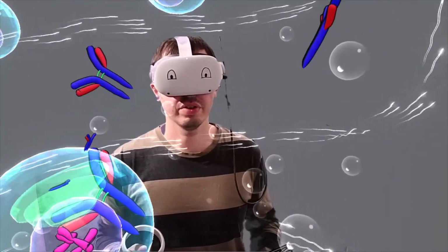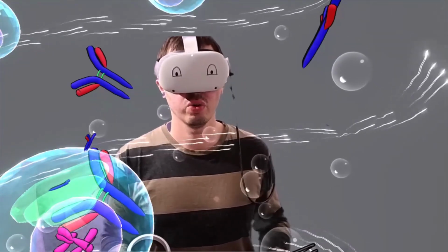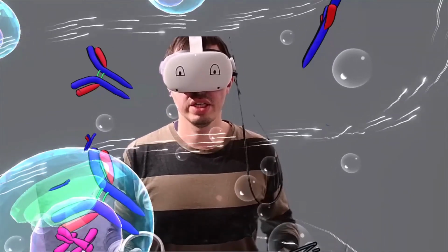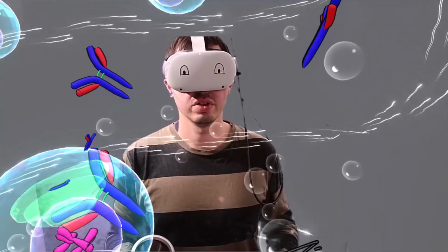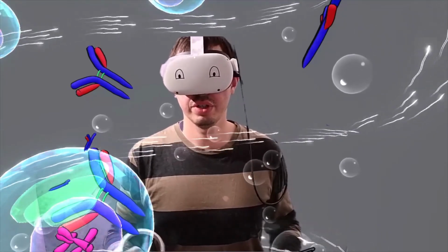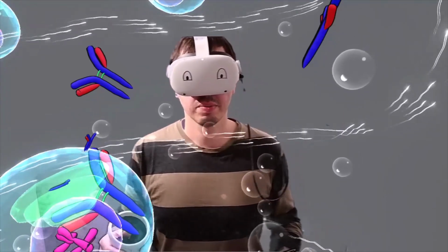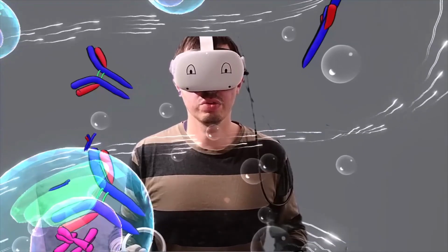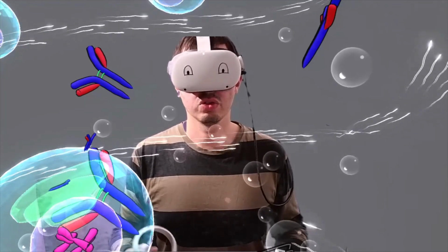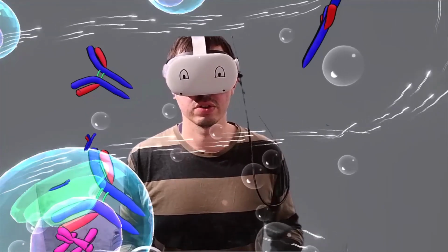These antibodies, once you have a high concentration, or at least once you get the maximum concentration without having too much heterogeneity, then you have to empty the tank, or at least take out part of the reaction medium, and then you'll have purification steps to avoid any residual cell material. We call them host cell proteins. Purify the antibodies in order to be able to formulate them inside vials, which are to be controlled and then released to carry on for the experiments or the clinical trials.